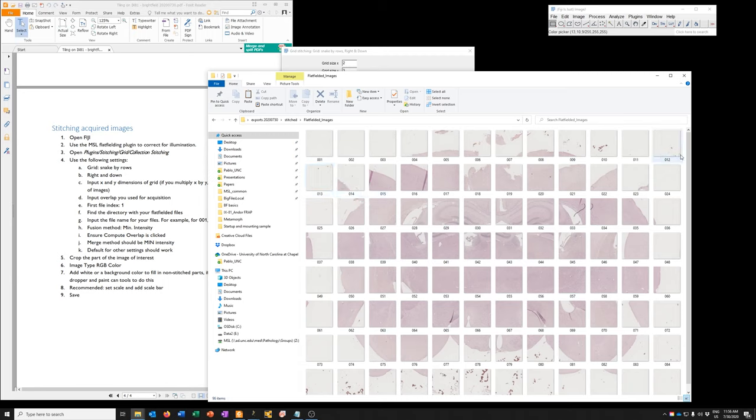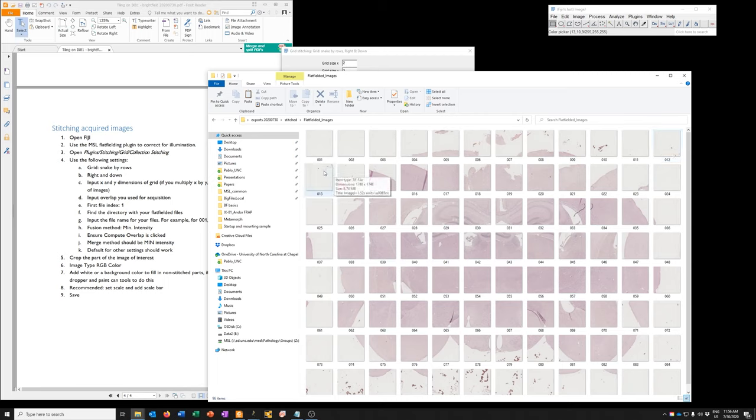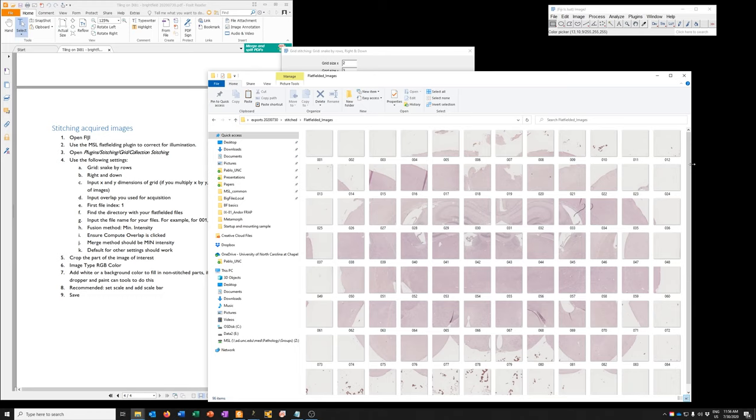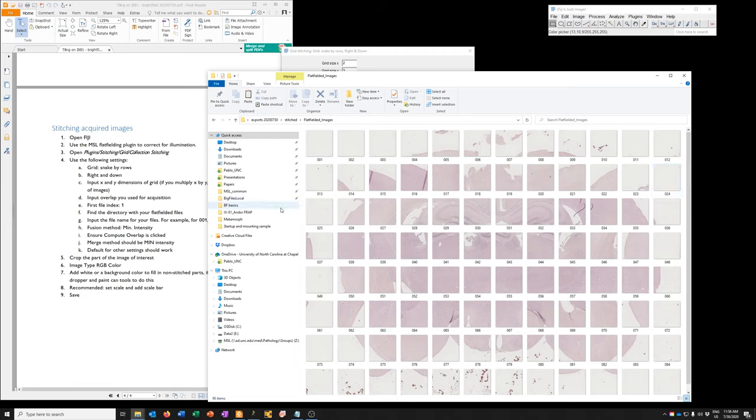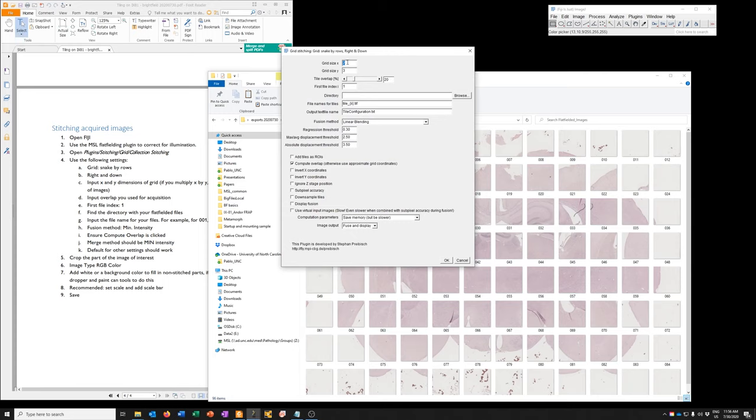And so if that's true, then the bottom right-hand corner of this tile number 12 should be the top right-hand corner of tile number 13. And in fact, you can see it is. These little blobs here correspond to these. So everything is correct. That means that we had 12. So our idea for how many there are was correct. So we have 12 columns and 8 rows.